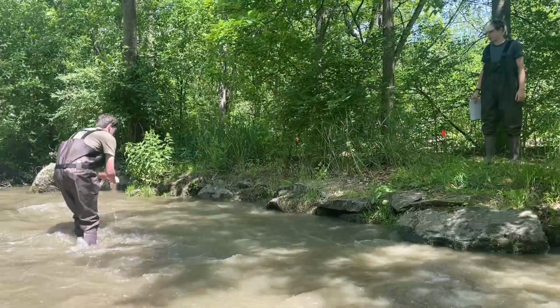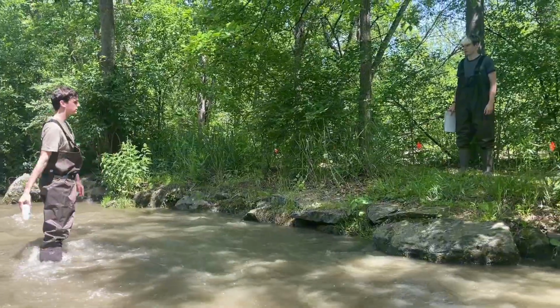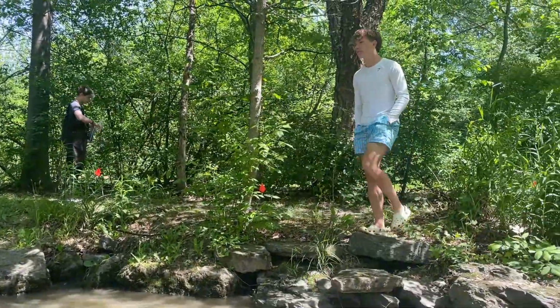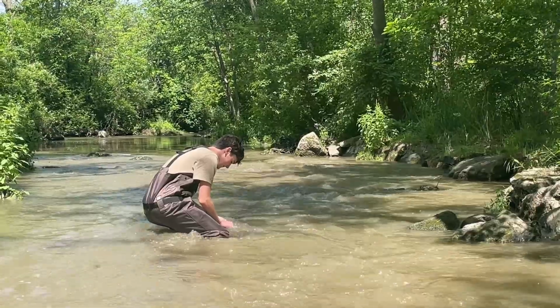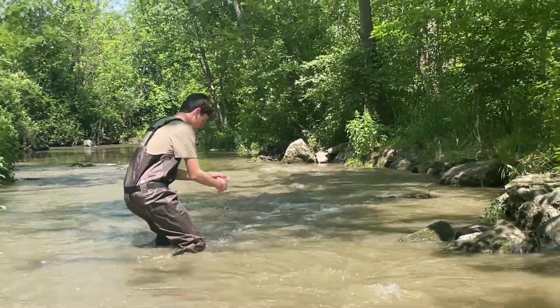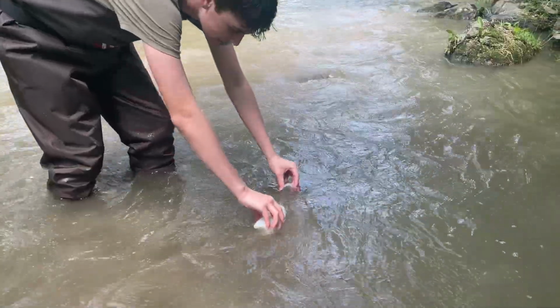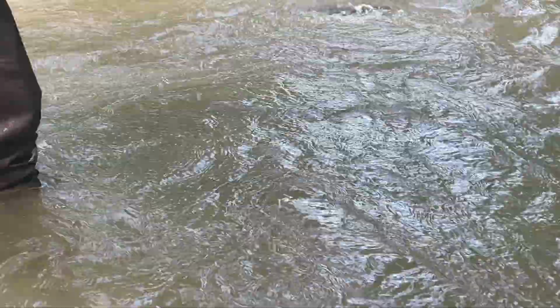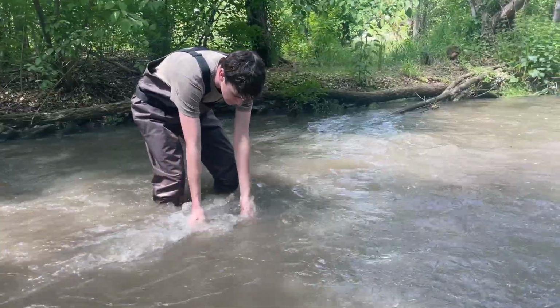Remove the probe from the short-term storage bottle, pour the solution into the 100 ppm bottle, and rinse the probe with distilled water. Submerge the probe in the 1 ppm solution and let the value settle, and then click Save. Remove the probe and rinse again. After this, you may test. It should then be stored in a long-term storage container after you are finished, which has a sponge in the bottom.